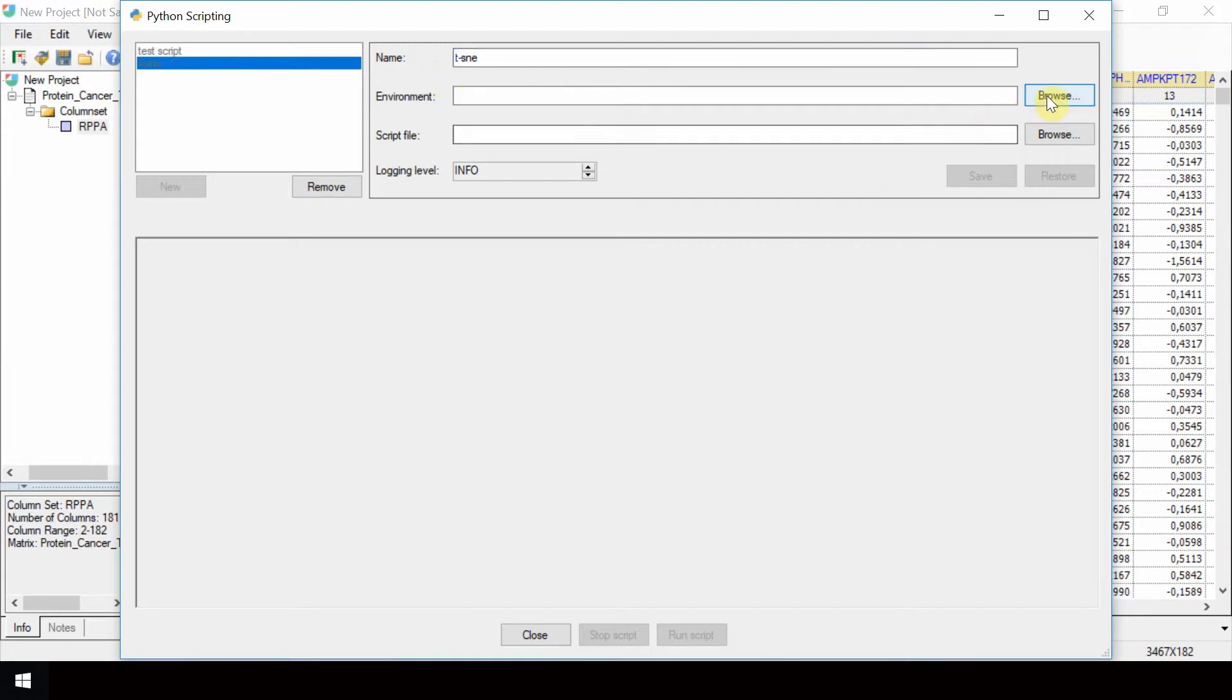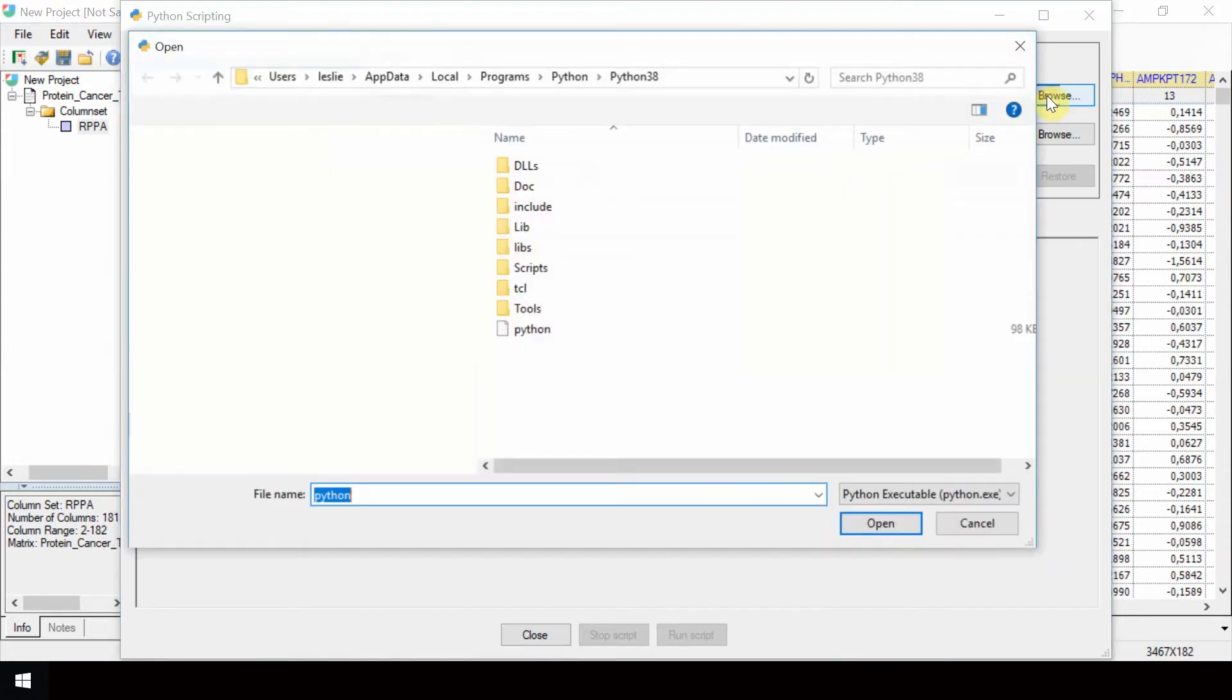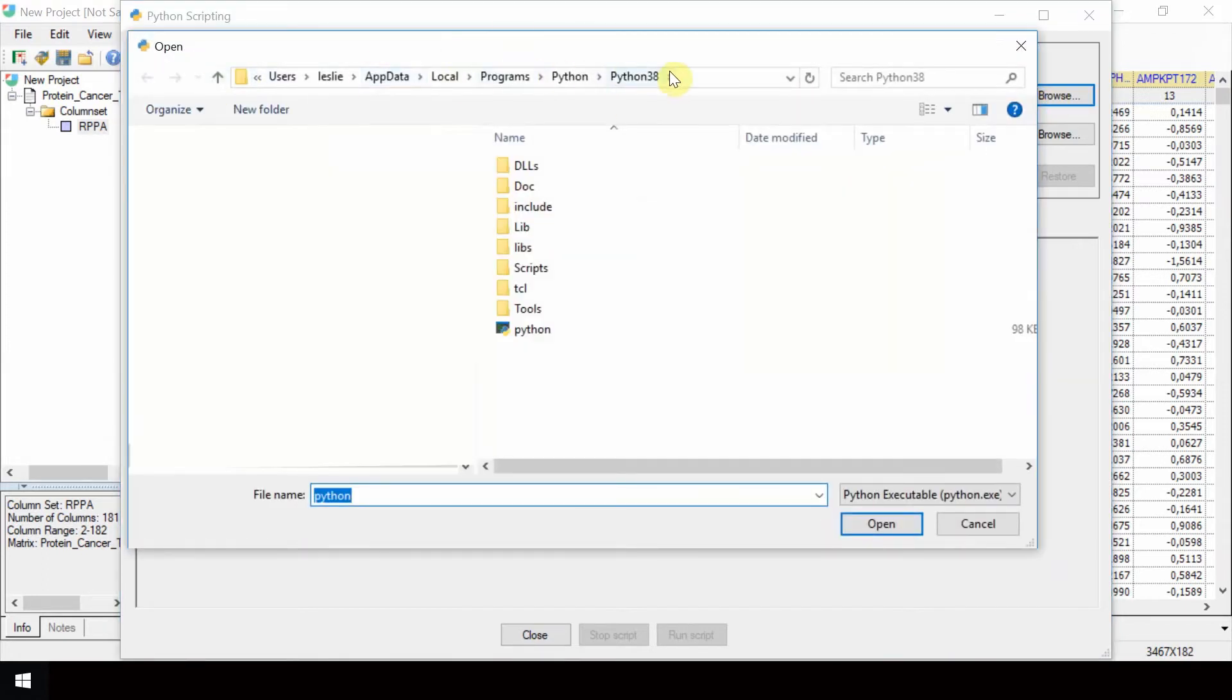In the Environment field, browse to the location where Python is located and select the python.exe file.